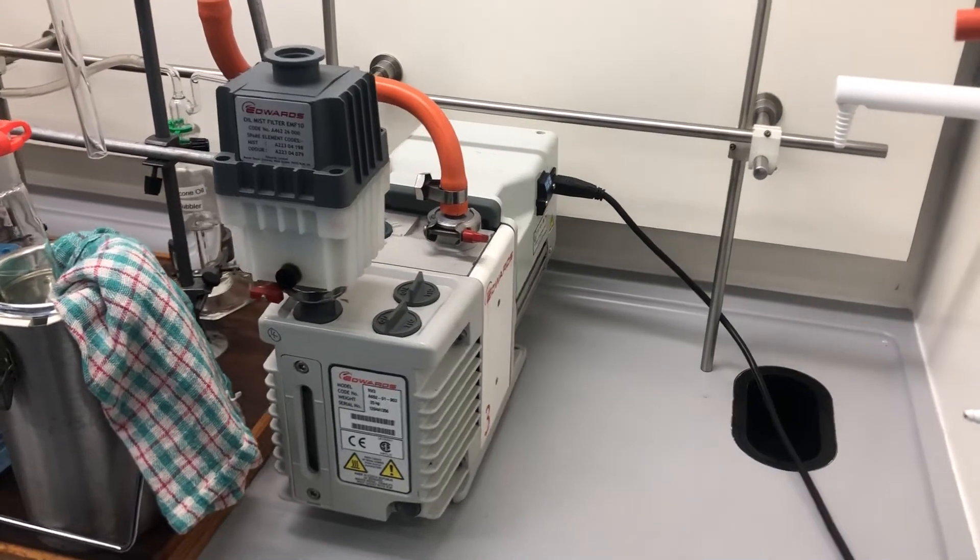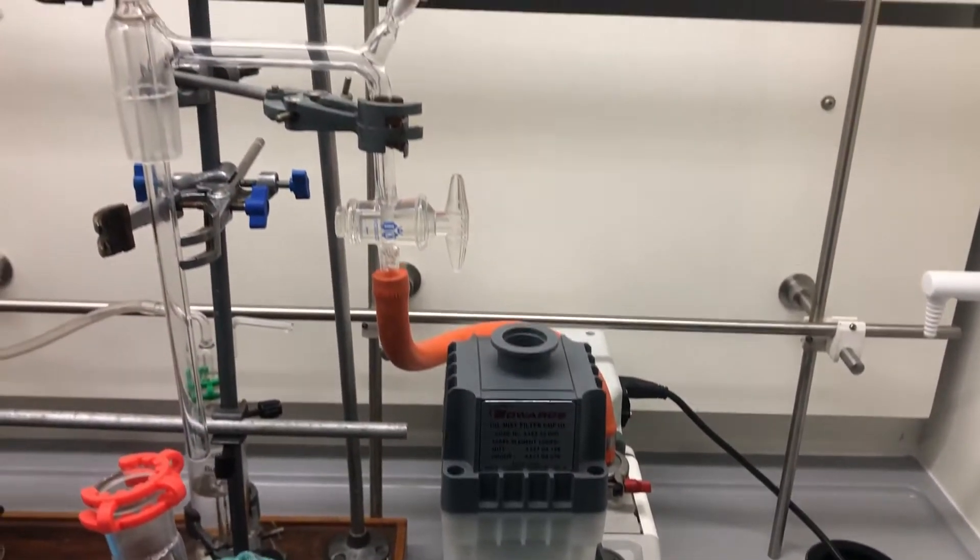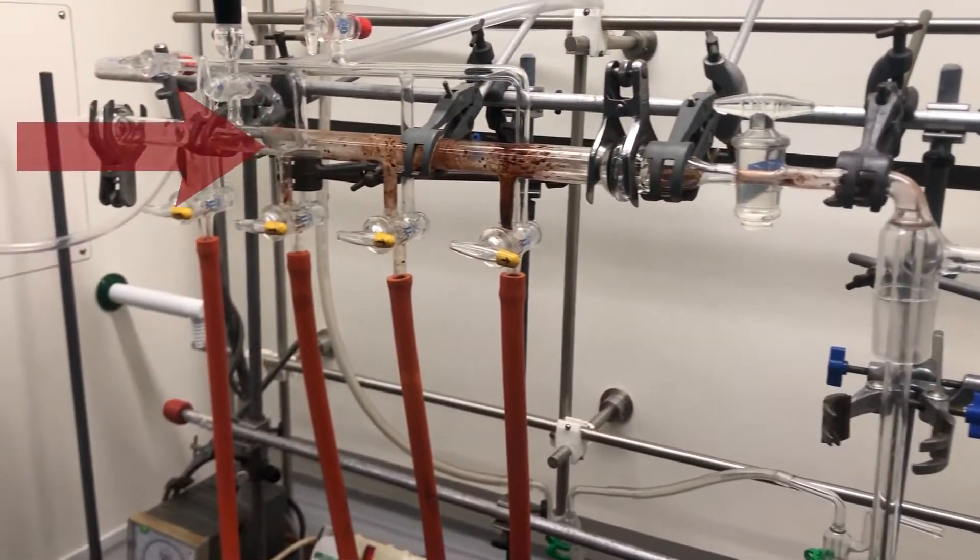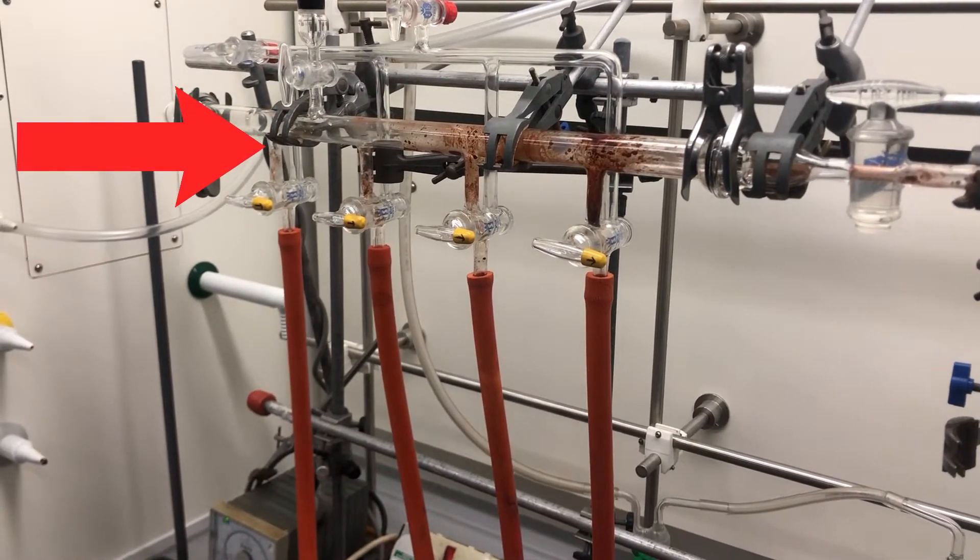We have our pump here that's plugged in and attached to a vacuum manifold, and that is put under low pressures by the pump.